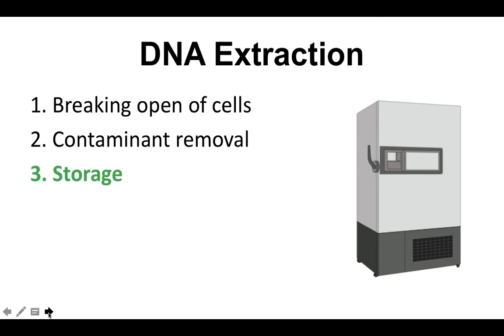Okay? Now, the last and final idea or principle that must be observed in any protocol of DNA extraction is proper storage of the extracted and purified DNA. Usually, of course, in laboratory settings, DNA is commonly stored at low temperatures, from 4 degrees Celsius to probably negative 20 or negative 80 degrees Celsius, to avoid enzymatic degradation and other unwanted chemical reactions. DNA is often stored as a precipitate, so it is allowed to precipitate in the presence of ethanol at negative 80 degrees Celsius.